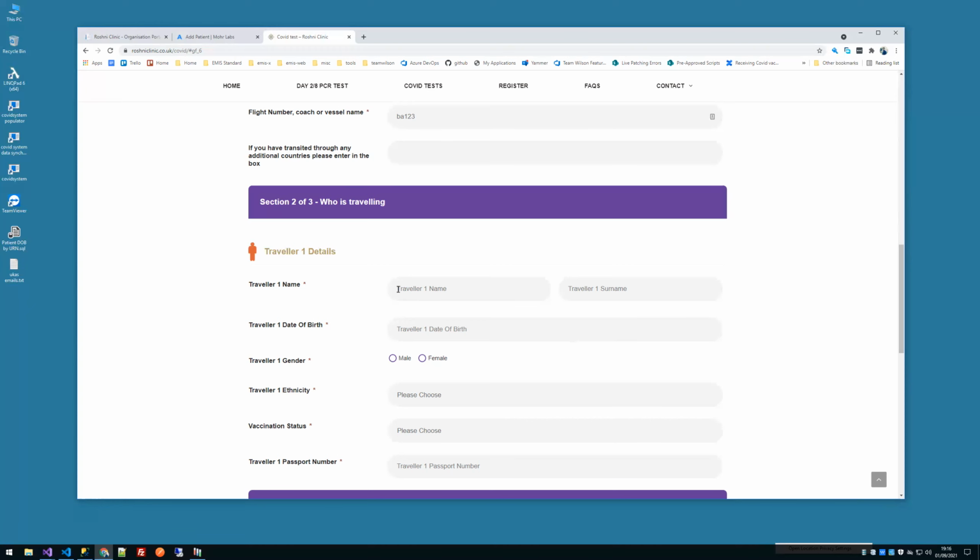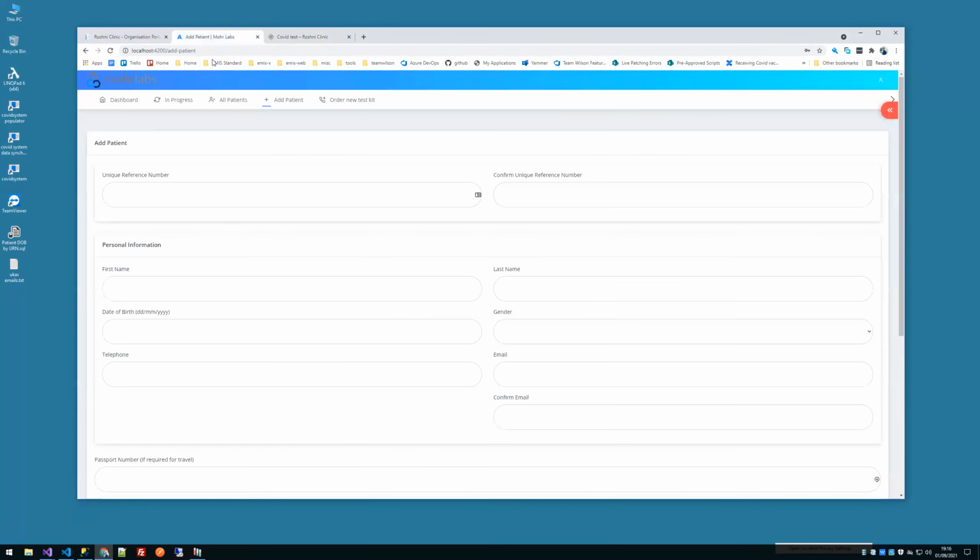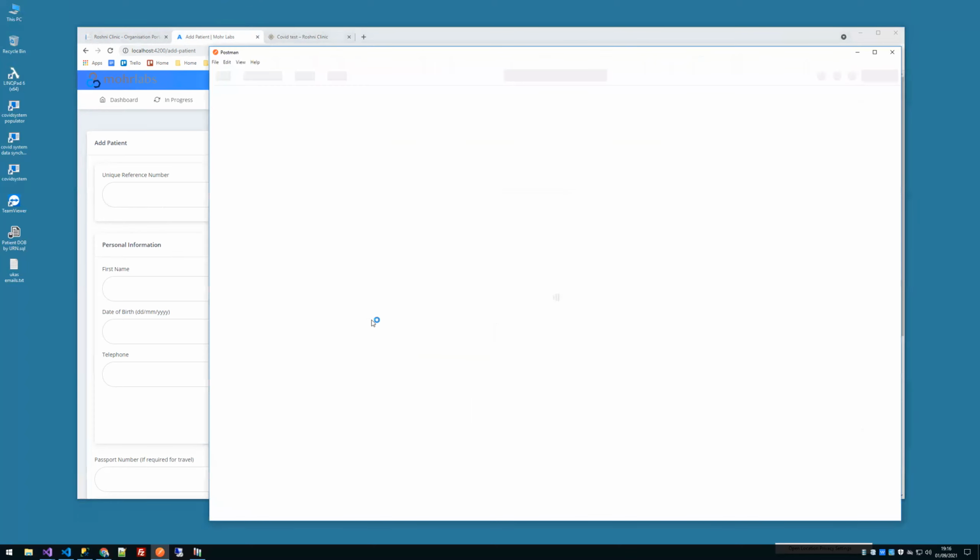We can support you with the software, the website, the APIs as well. So if you don't like the website or whatever, you can choose your own and create your own and call APIs. I don't know if you've seen Postman or whatever. I'm just going to show you so you can pump things into the system through any sort of API calls, whatever language.